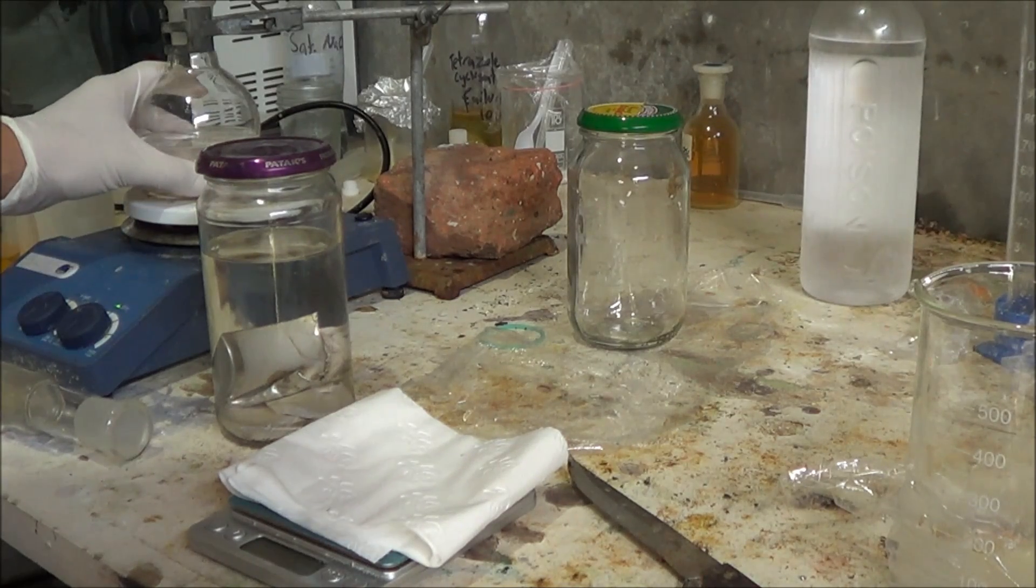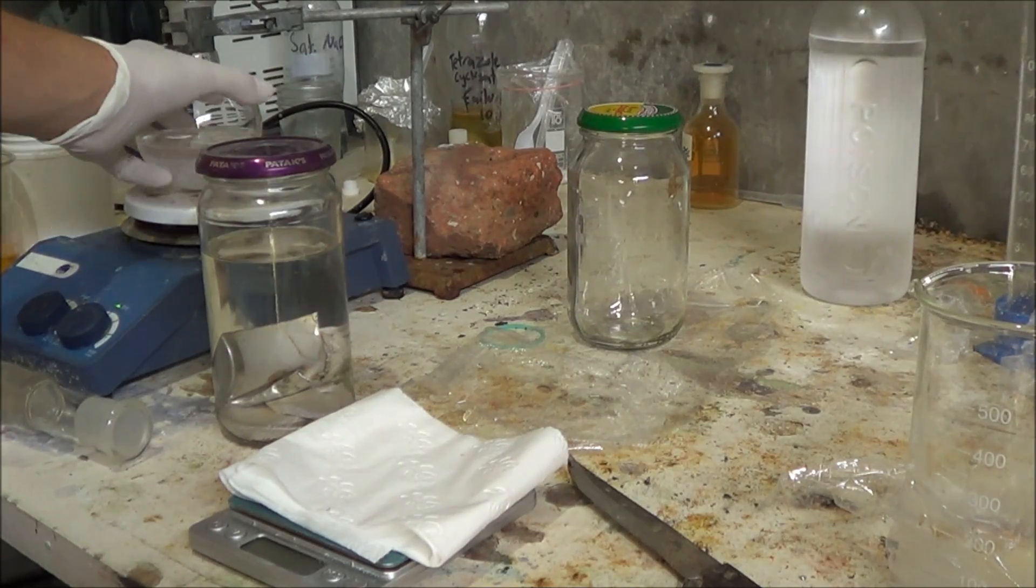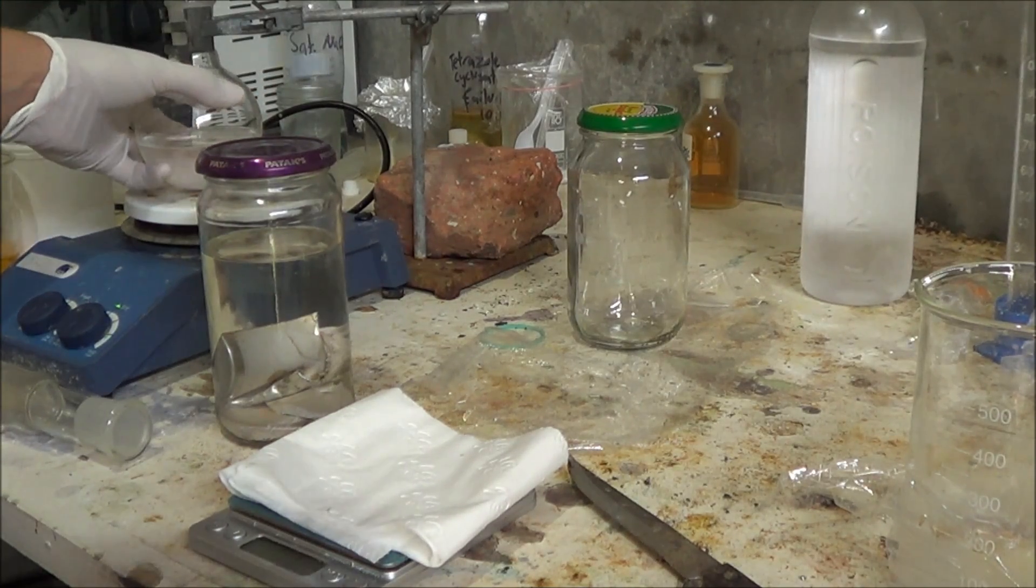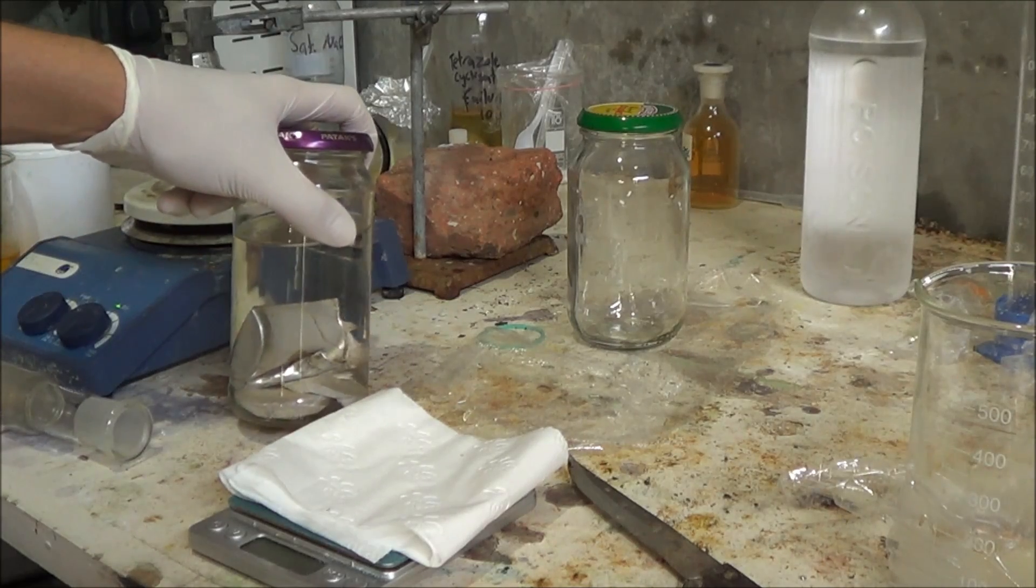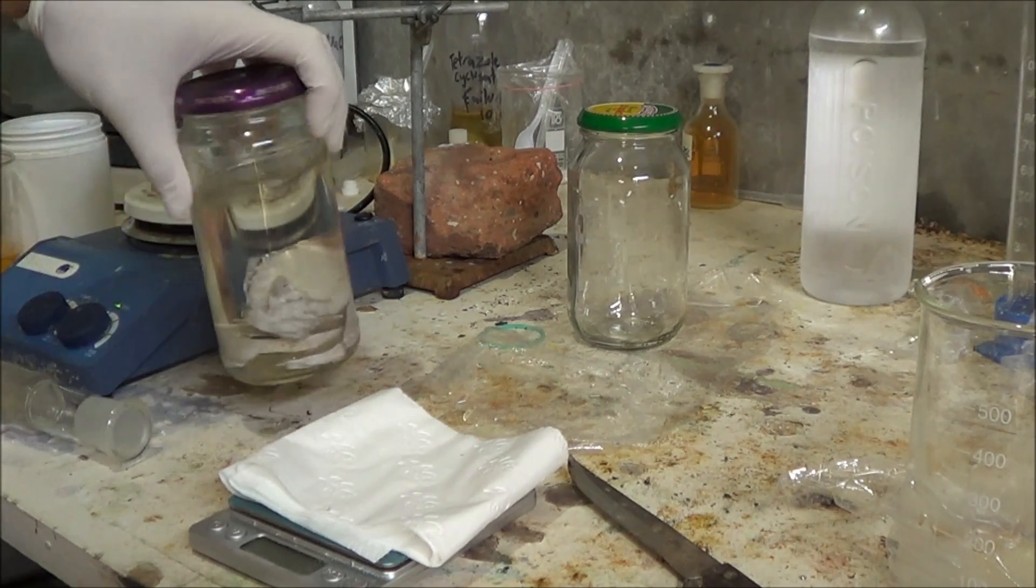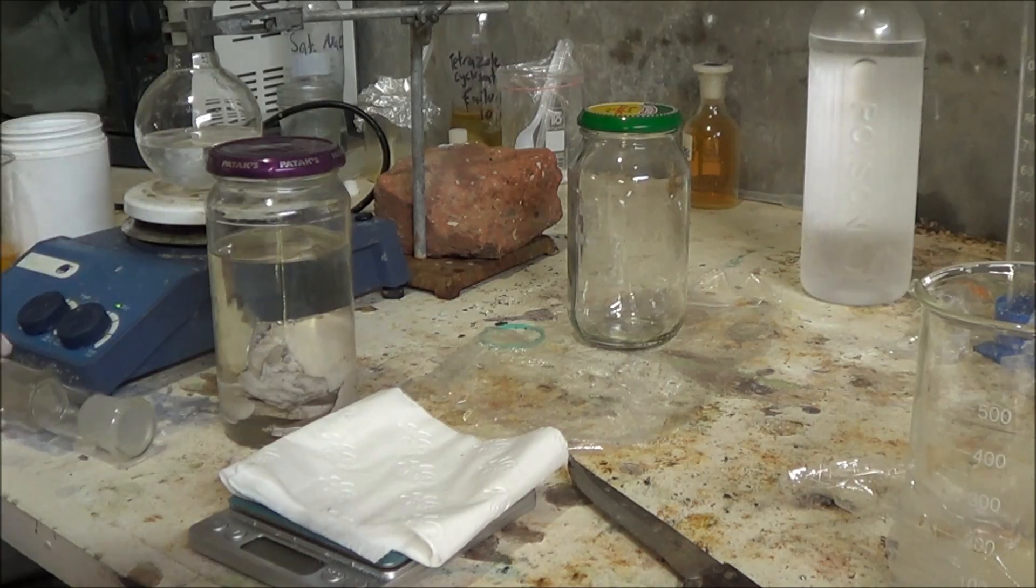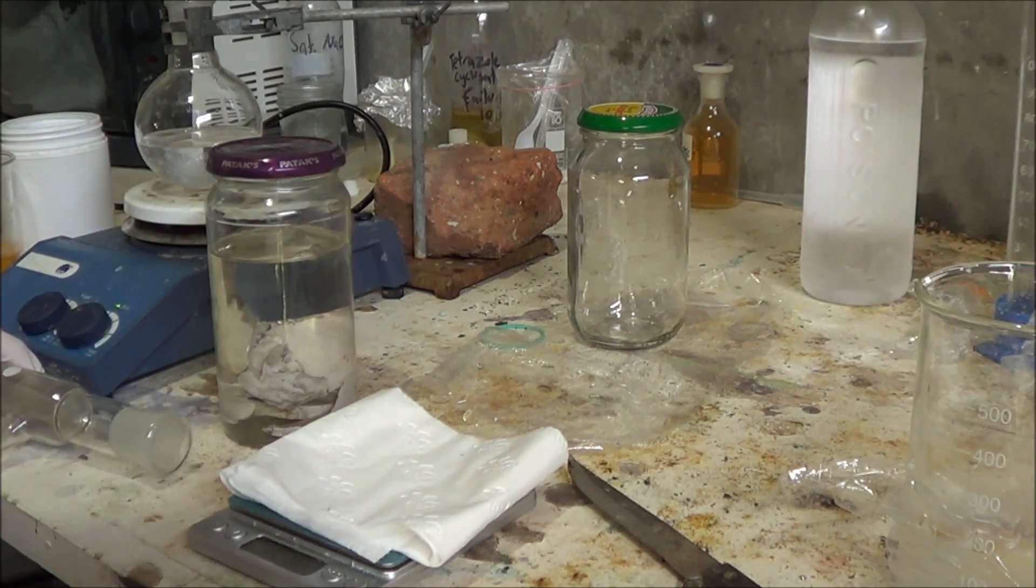So instead we have cold ethanol. We've got 100ml of it here in this flask. And we're going to set this up for reflux. And I'm going to grab 5g of the sodium, I'm going to dry off as much mineral oil as possible, cut them into sort of small pieces. And we're going to put the ethanol, put the condenser on, set up the water and watch it go.